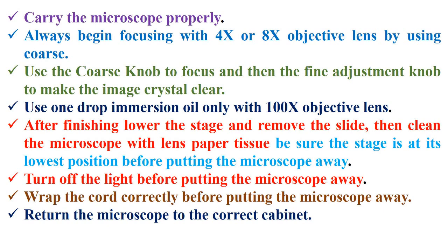For handling the light microscope: 1. Carry the microscope properly. 2. Always begin focusing with the 4x or 8x objective lens using the coarse knob. 3. Use the coarse knob to focus, then the fine adjustment knob to make the image crystal clear. 4. Use one drop of immersion oil only with the 100x objective lens. 5. After finishing, lower the stage and remove the slide, then clean the microscope with lens paper, ensuring the stage is at its lowest position before putting the microscope away. 6. Turn off the light before putting the microscope away. 7. Wrap the cord correctly before putting the microscope away. 8. Return the microscope to the correct cabinet.